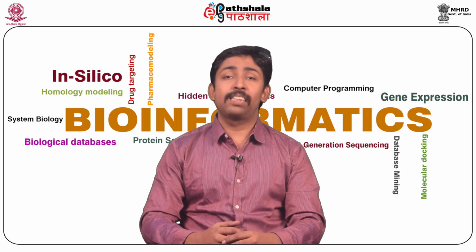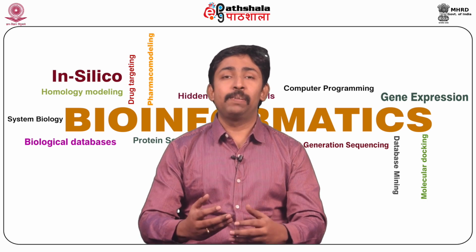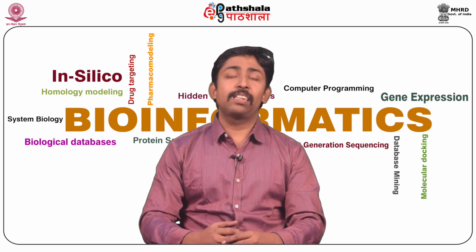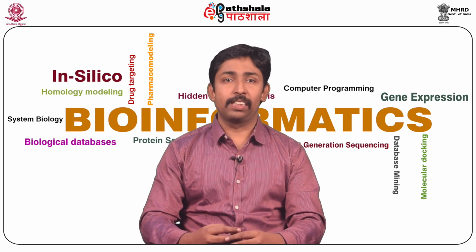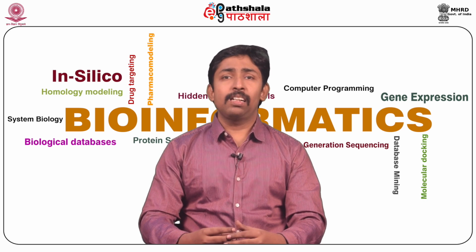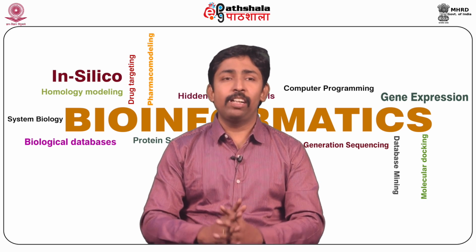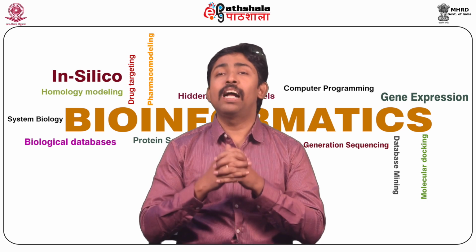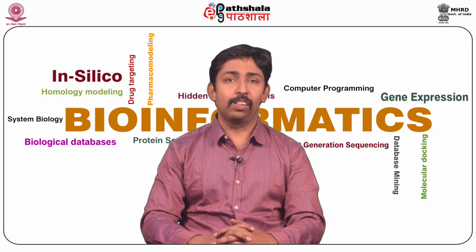More detailed instructions for installation can be obtained from the URL biopython.org/DIST/docs/install as a PDF file, or if you want to read it as an HTML file, that is also possible. Sequence objects and sequence record objects. BioPython has two different methods for handling sequences. It has a sequence object and it has a sequence record object as well.